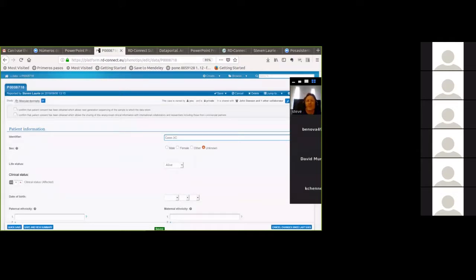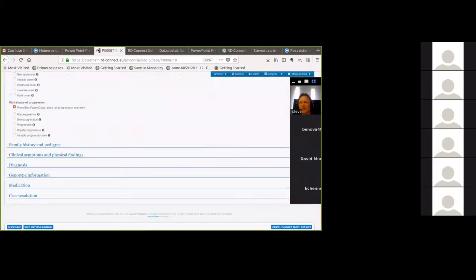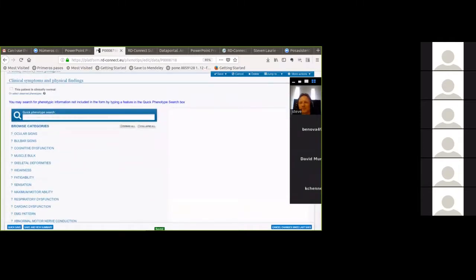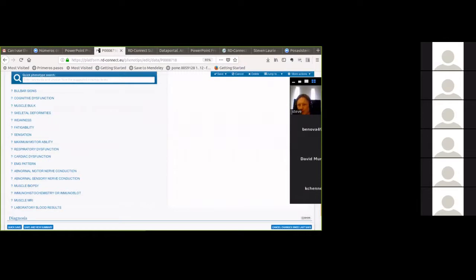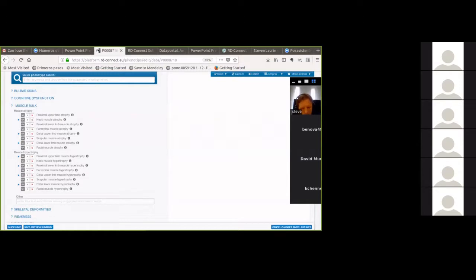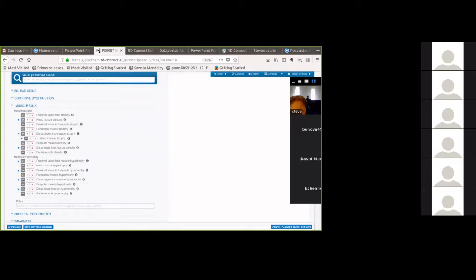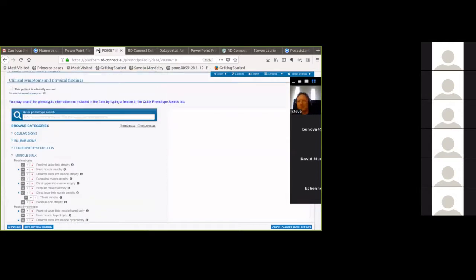So the case is 3c and she's a girl. Then we go down to clinical symptoms and physical findings, where you have a number of sub-menus that each open up in a tree-like format to let you find the phenotypic characteristic you're looking for. For example, if we want to enter quadriceps muscle atrophy — once you're familiar with it, you'd know this is going to be in muscle bulk, under atrophy, in distal lower limb.